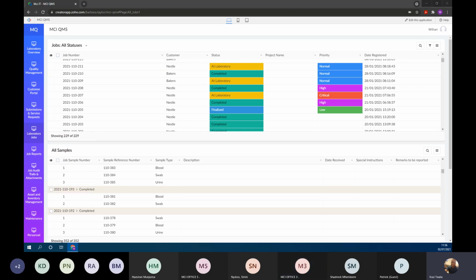So whatever happens in between is neither here nor there. But as a lab manager, especially during a pandemic such as this, the critical situation is the throughput of how many tests you are able to put through the system as quickly as possible. So you might say, for me, the way the whole thing works more effectively is I've cut down the process of processing a sample, from receival of a sample, going through, checking, putting whatever liquid or chemical into that particular sample, producing the results, and then being able to communicate the results.